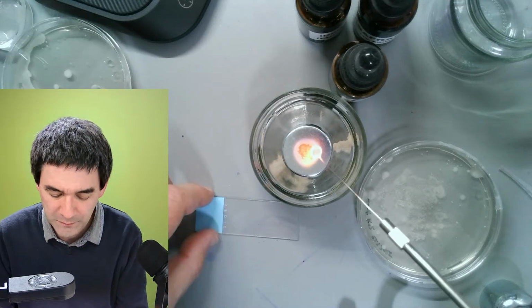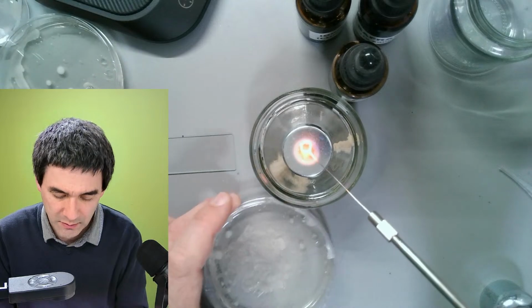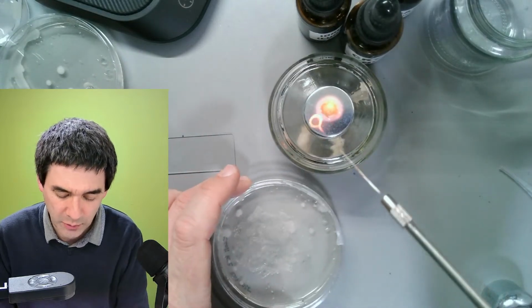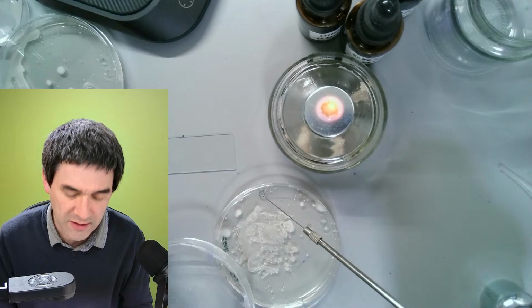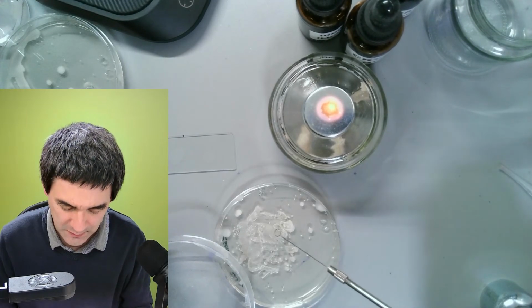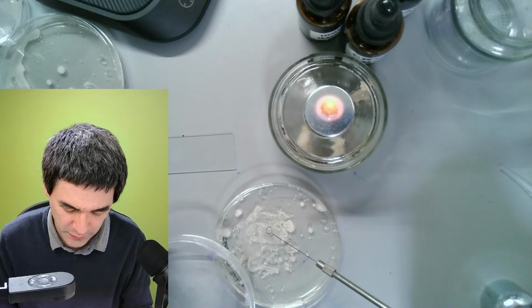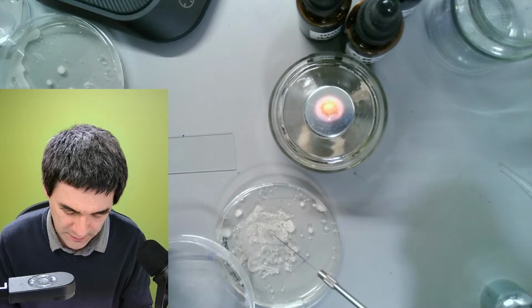And over here, I'm going to do the same thing with the E. coli. However, it also contains a lot of contaminants, which is okay. For our purposes, it's just a demonstration here. See, I have a real problem picking up cells here.